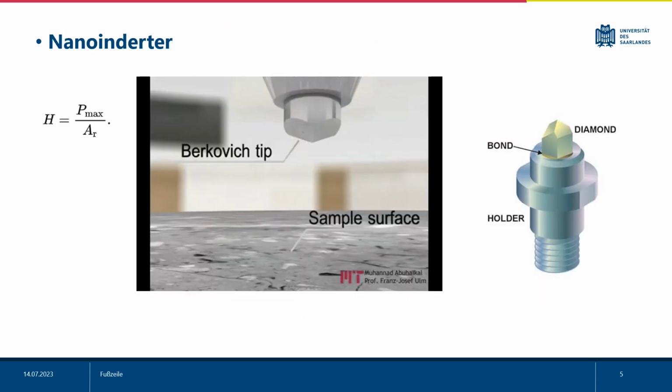Nanoindenter is a device used to measure the nanoscale mechanical properties of material surfaces. This device is known as a hardness tester and applies an indenter with a 1 or more micron size to the surface of the material in a controlled manner. This indenter, while applying a microscopic force, leaves marks or deformation on the surface of the material. The nanoindenter is used to measure the mechanical properties of the material such as elastic modulus, hardness, flexibility, yield strength, fatigue resistance, and surface properties.